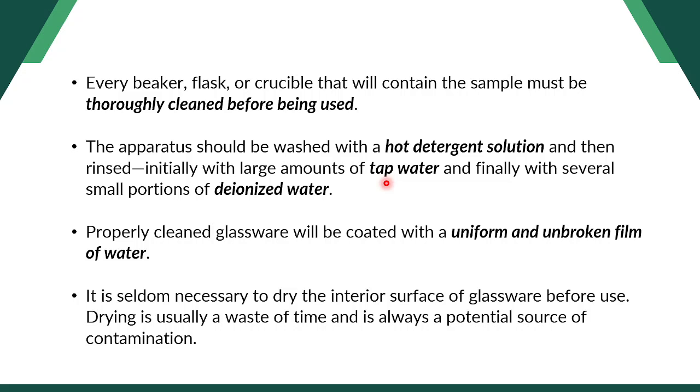Now, enough lang ba ma'am nga tap water ang i-rinse? Dili. So, the answer to that is no. Because after washing our apparatus, mga glasswares, they should be rinsed with deionized water.